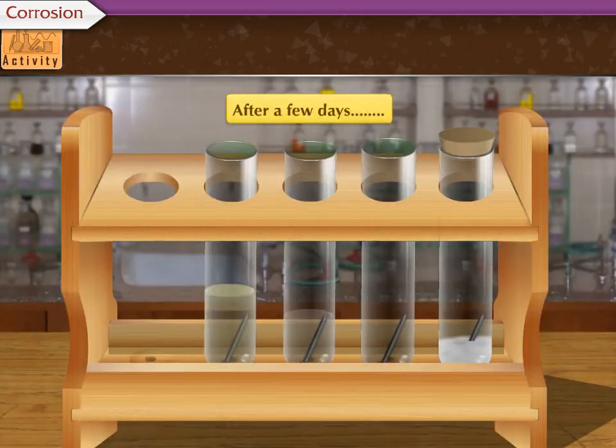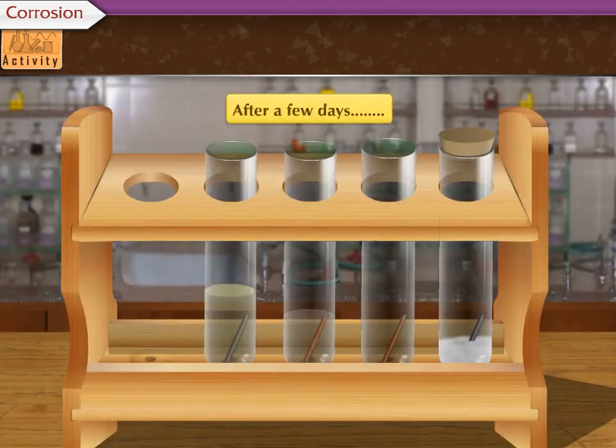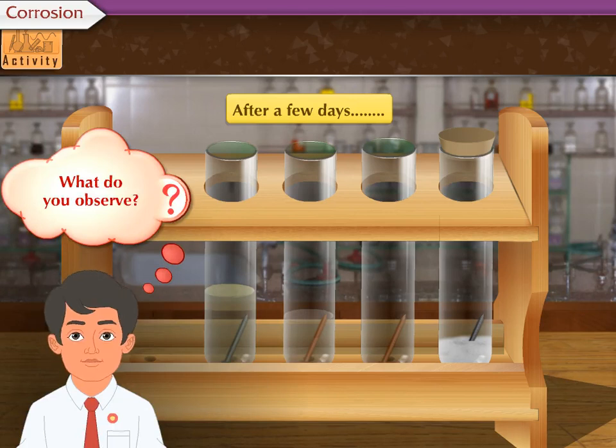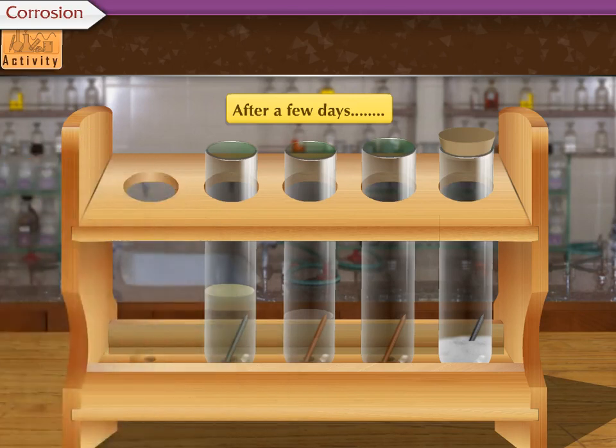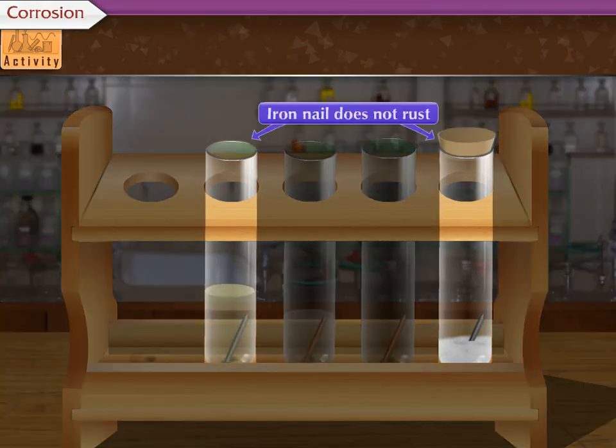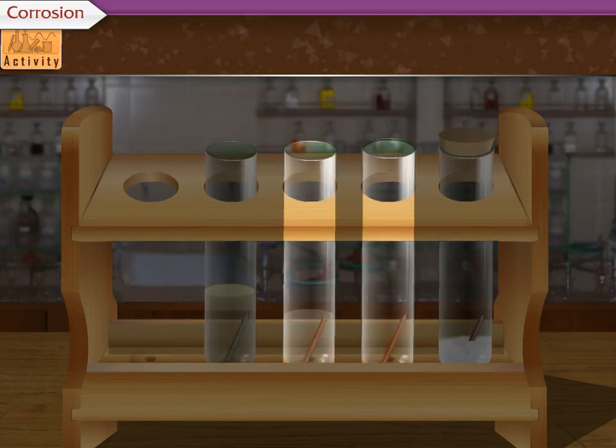After a few days, observe the four test tubes. What do you observe? The iron nail in the first and the fourth test tube remained as before, while the nail in the second and the third test tube was rusted.